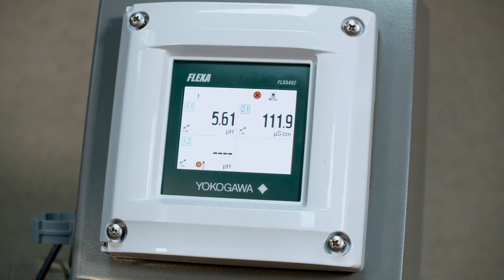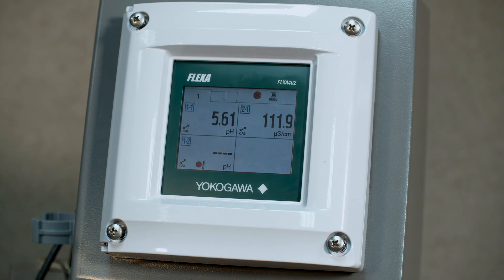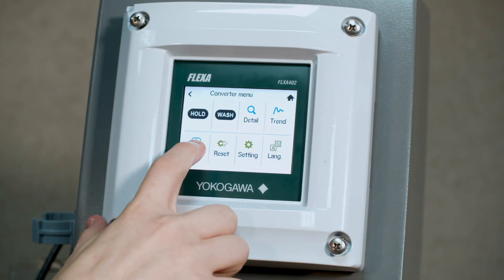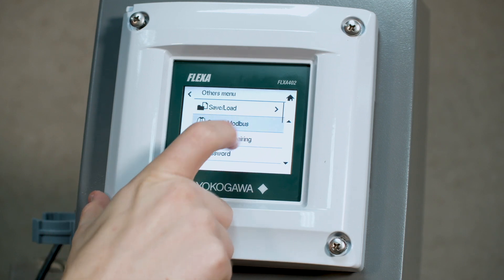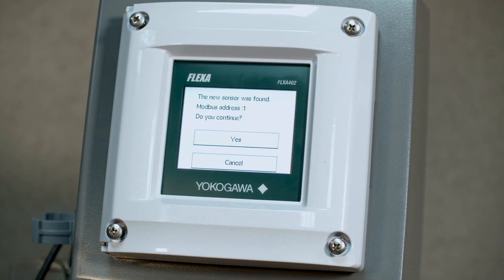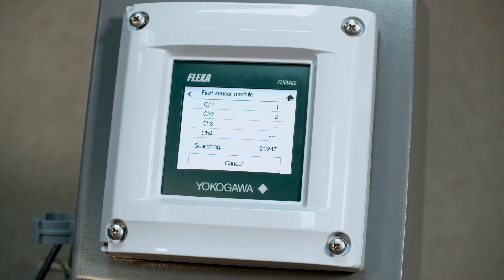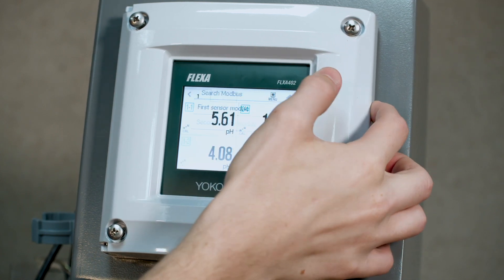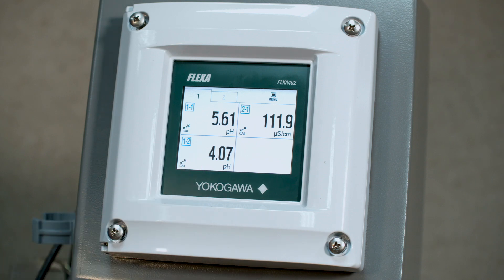Now you'll wait for a little bit and see if your sensor starts reading and comes online. If it is not, there is one more opportunity to search the channel. To do that you'll go through menu, others, search Modbus, first sensor module, and hit start. Confirm any prompts. It'll take a little bit to finish, but once it's done hit OK, then go back to your home screen and you should see your sensor reading in the quadrant that you have set.